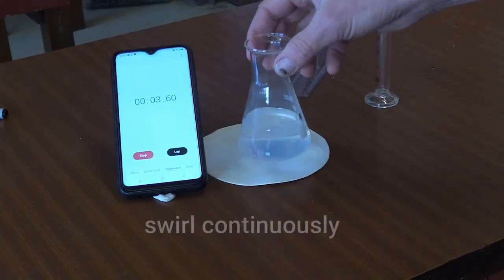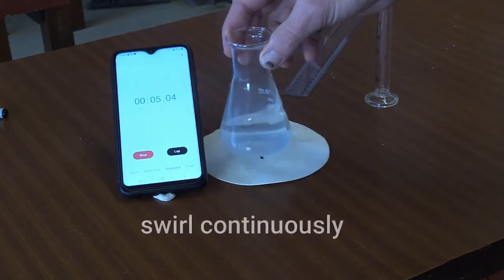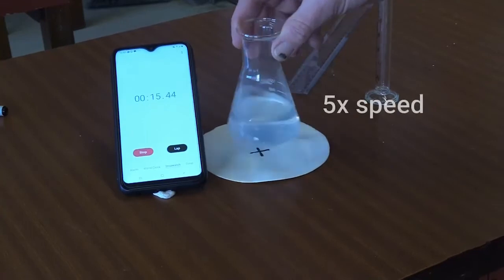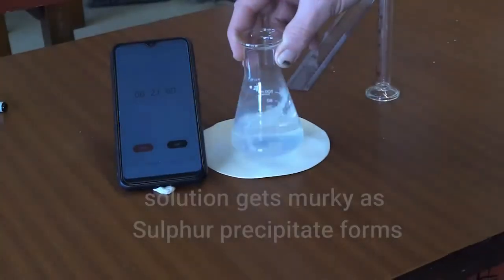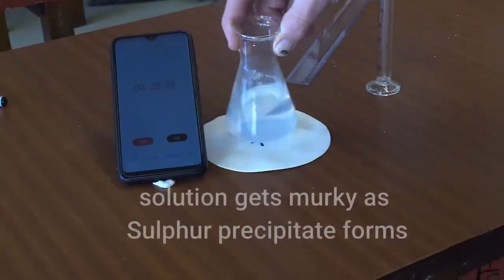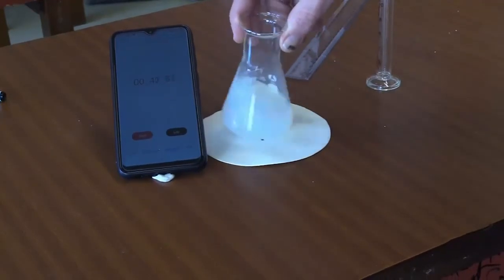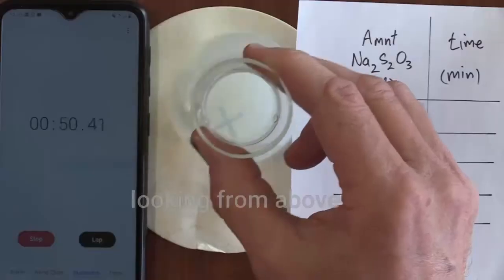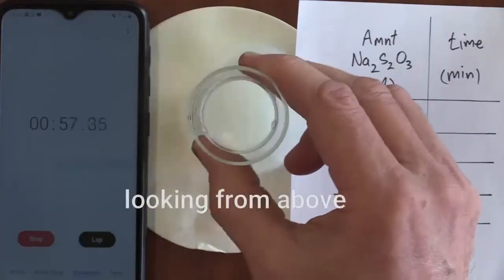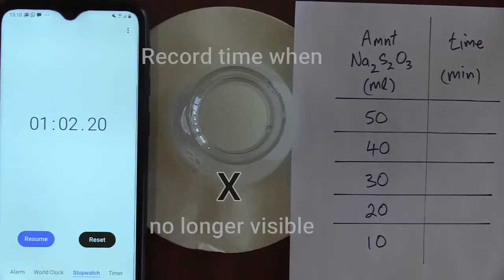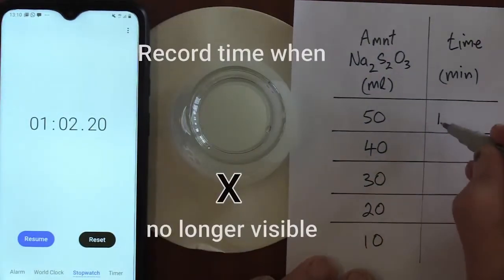We then swirl the conical flask continuously. This takes time so we've sped it up. Notice the solution gets murky as the sulfur precipitate forms. Looking from above, we record the time when the X is no longer visible at 1 minute and 2 seconds.